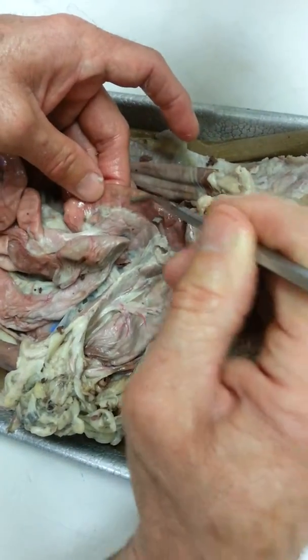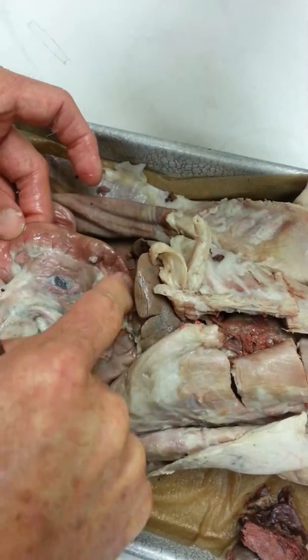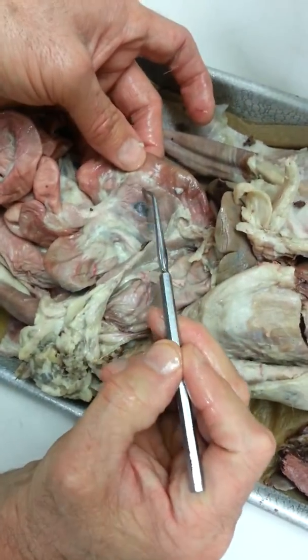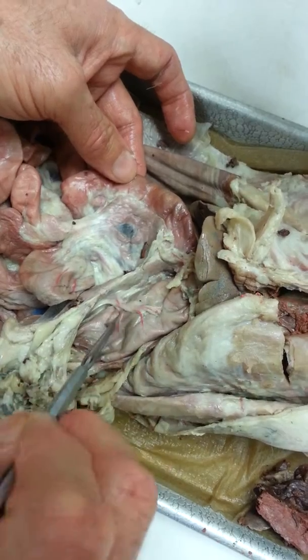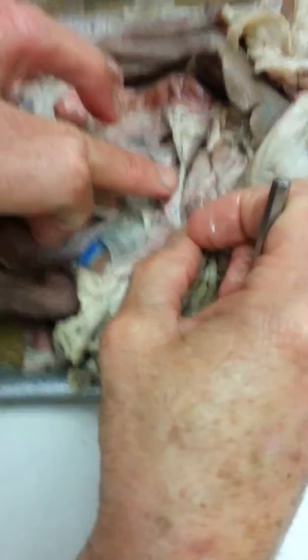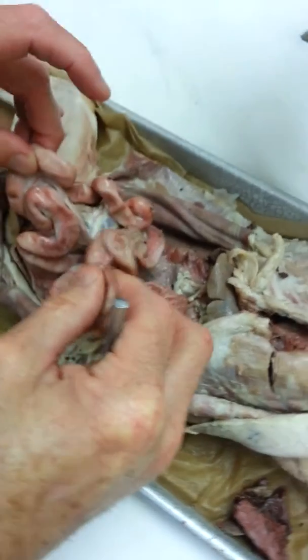So this first C-shaped section here is the duodenum of the small intestine. It looks like a C. It's the shortest and first section. All the grainy material right here, that's pancreas. And that runs all the way along the duodenum, and it actually runs clear up underneath the stomach. There's some of it right here that's grainy. All this is pancreas. The whole area right there is pancreas. And then the whole middle portion of the small intestine is the jejunum. So that's all.